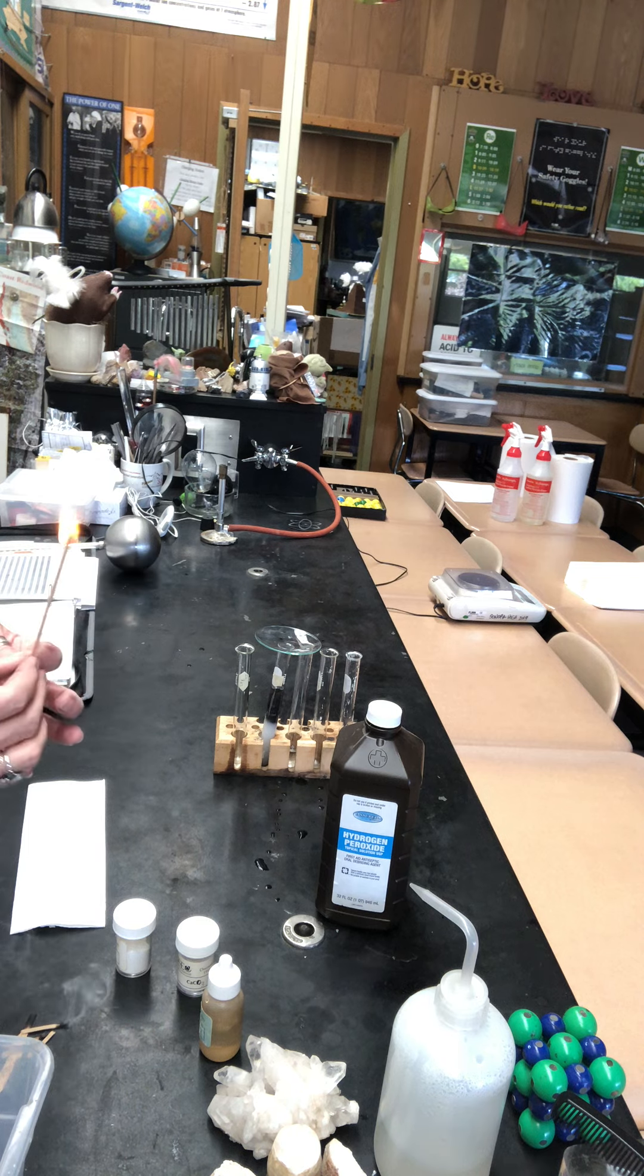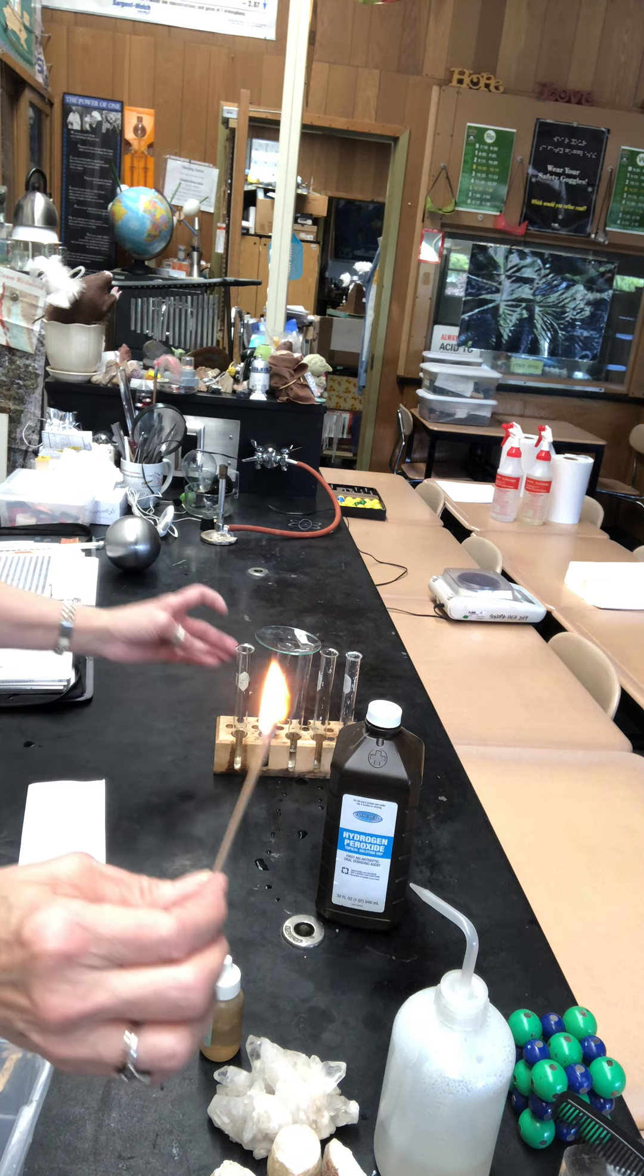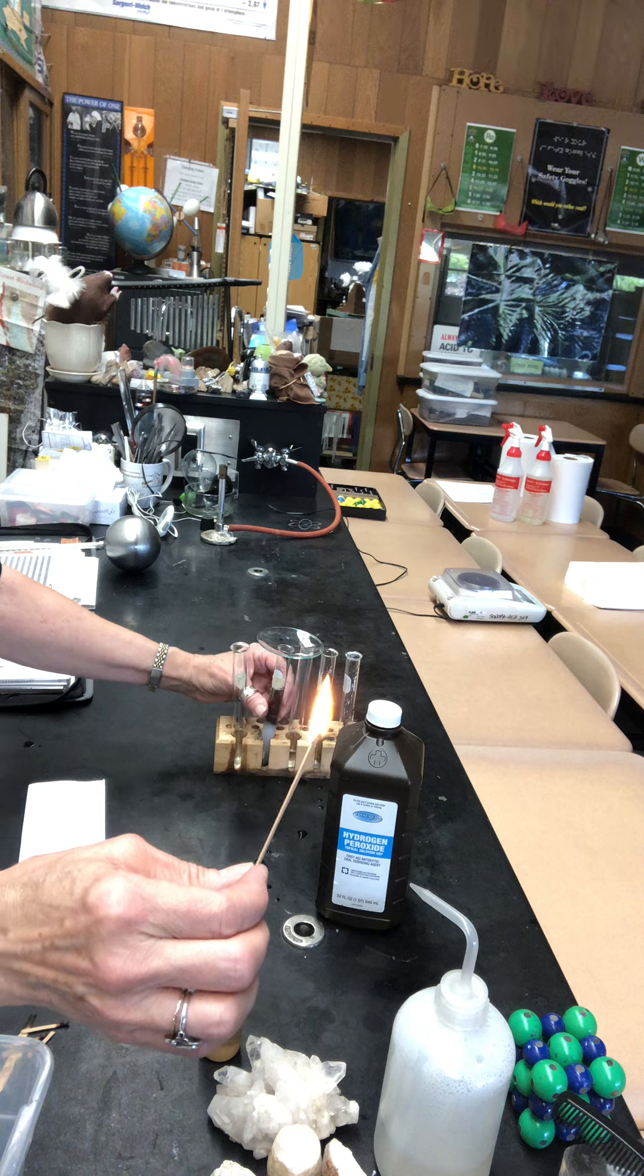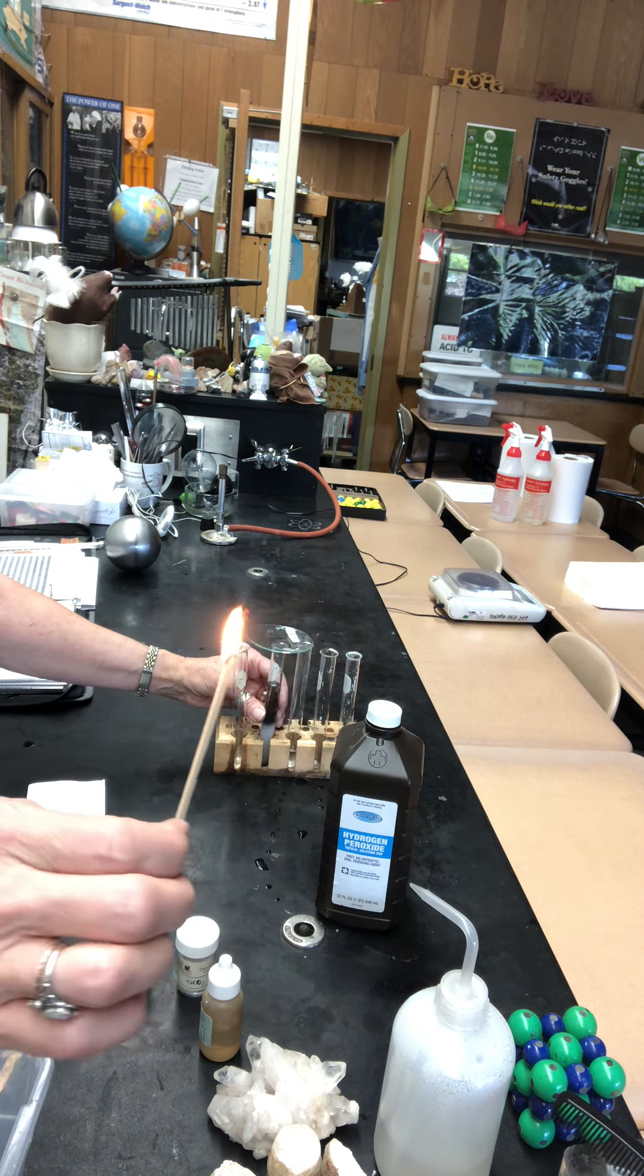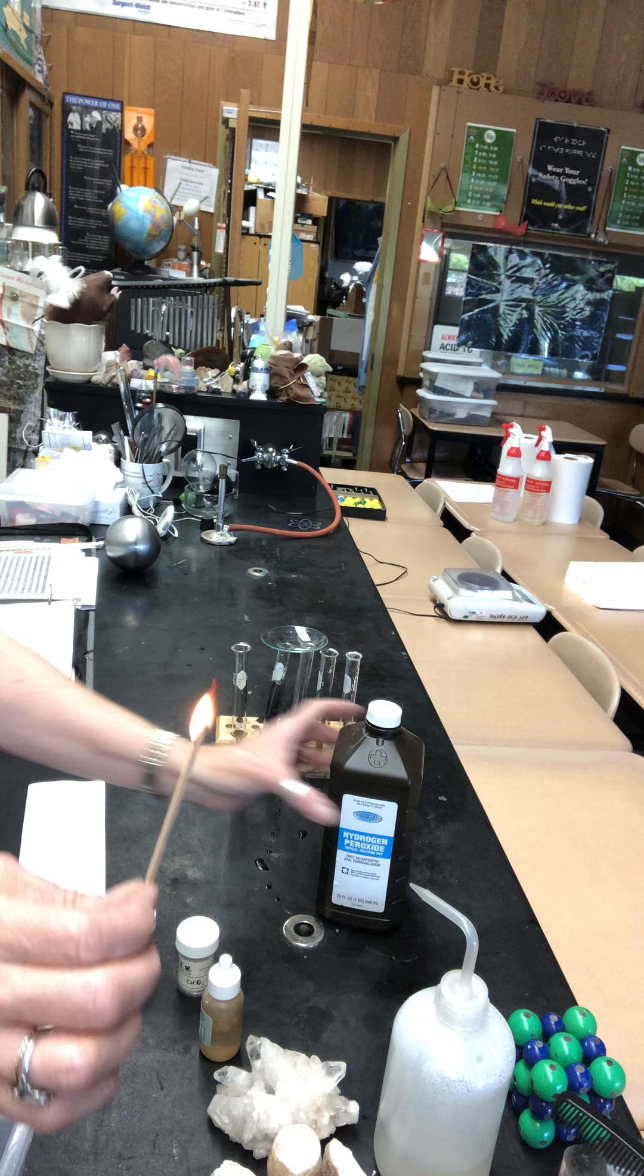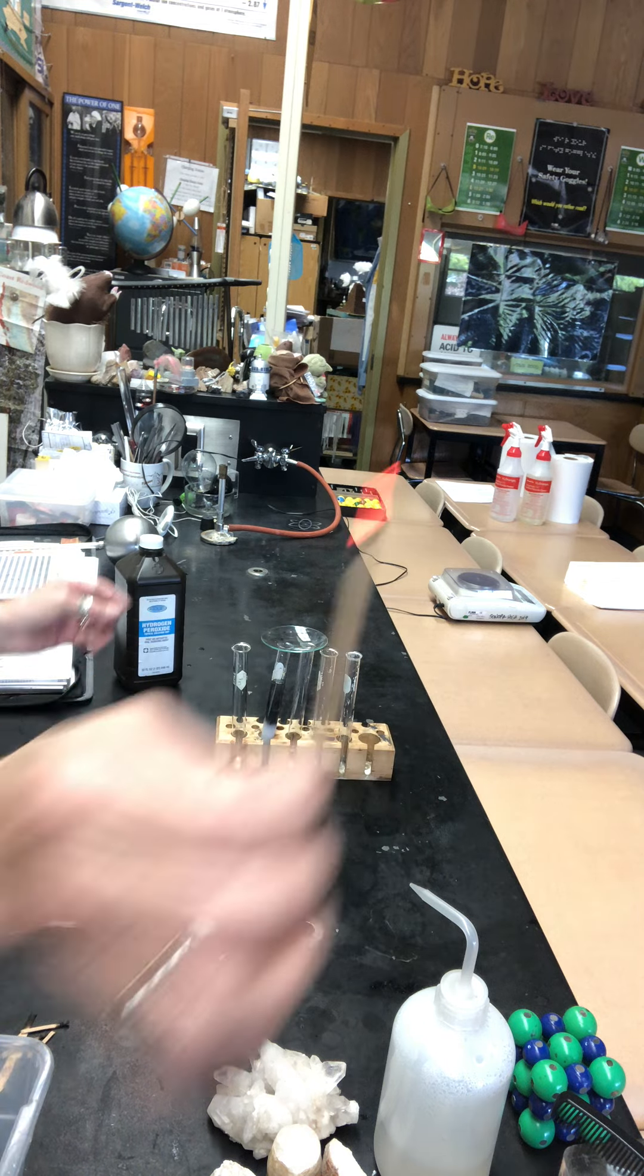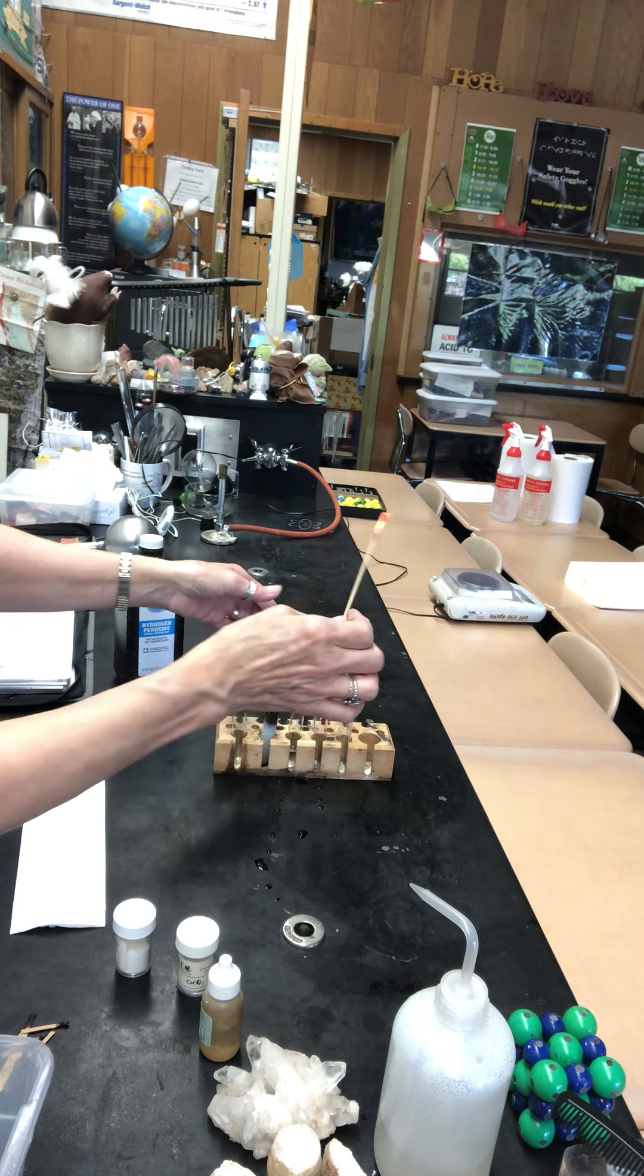So I want to let it burn pretty well so I can get a good area of glowing, and we'll see how fast I can do this. Hopefully you'll be able to observe it. So there's a glowing splint. Notice as I go fast it gets brighter.